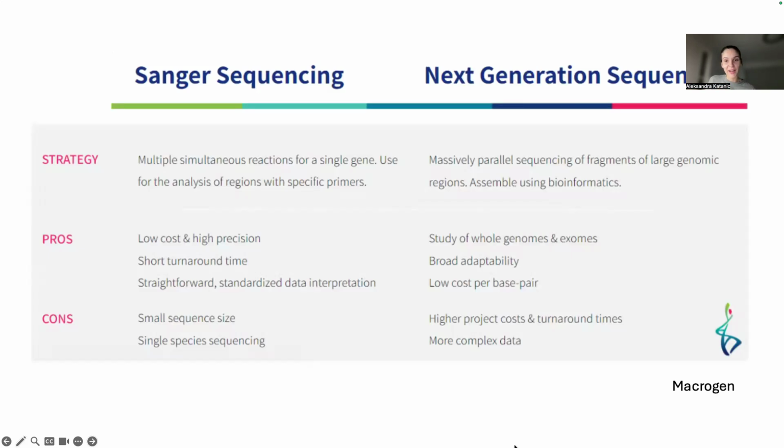And for the final slide, I've got a nice summary that I took from Macrogen to help you distinguish between Sanger and next generation sequencing.